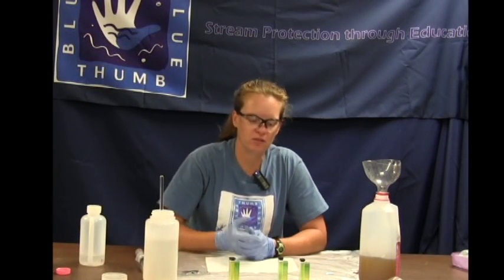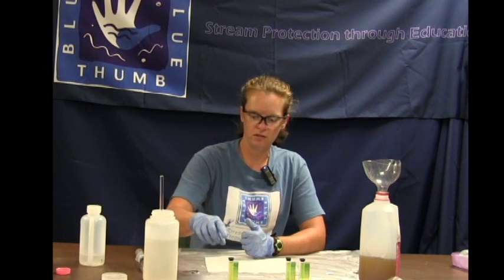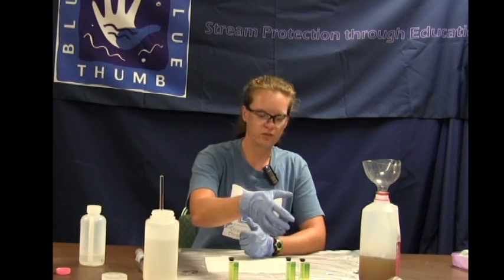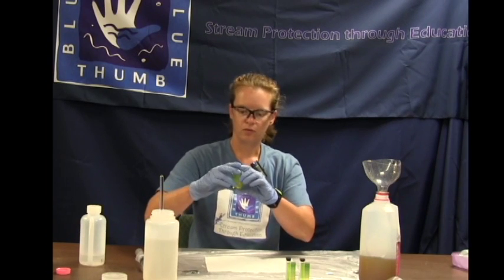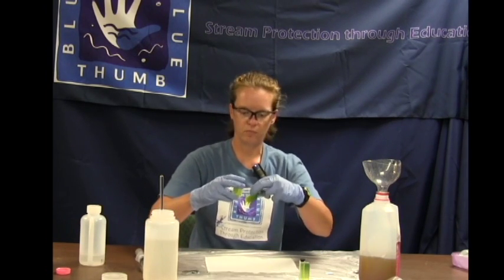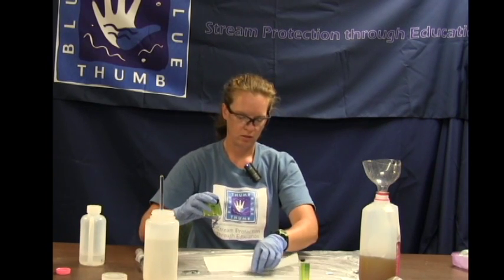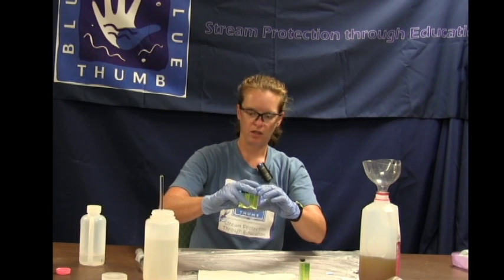Okay, after 15 minutes, we need to come back and look at our test cubes. You can definitely tell that one of them, the blank, is still yellow. And we have 2 creek waters, and they have a tinge of green to them. So now we need to take our readings. I usually compare the creek water to the blank, so I have a comparison. I'm going to use my white paper towel as a white backdrop.